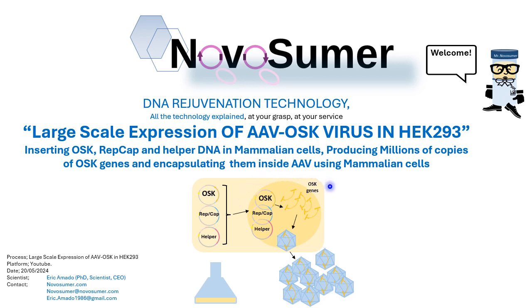And the cells will do all the work for us. The cells with the DNA will produce many copies of the OSK genes. You see here the copies of the OSK genes. The OSK genes, remember, are in the OSK DNA. Then the RepCap DNA will serve the following purpose.